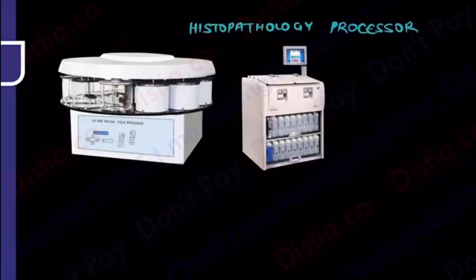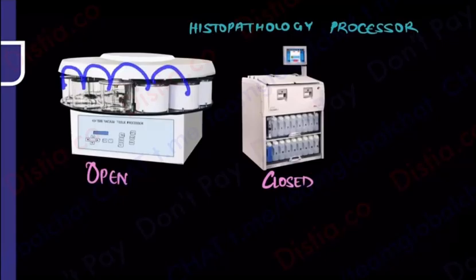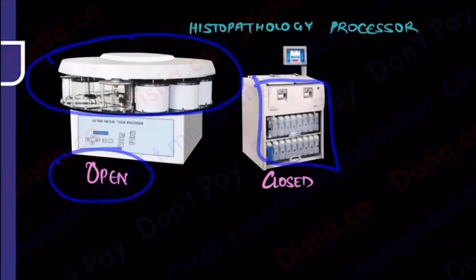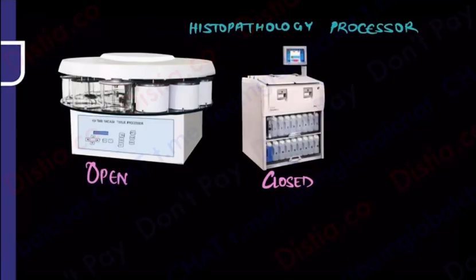So this is known as the closed histopath processor machine. This is an open one. Why do I say closed and open? Because open matlab you can see all the processes like it's live, you can see everything happening live in front of you. This is closed because once you put the tissue inside, the machine will do all these steps and you won't be able to see them. Because you can see them live in the open machine, you call it an open machine. You cannot see anything live here, so it is called a closed machine. The difference is just the view, and otherwise these are all histoprocessor machines.